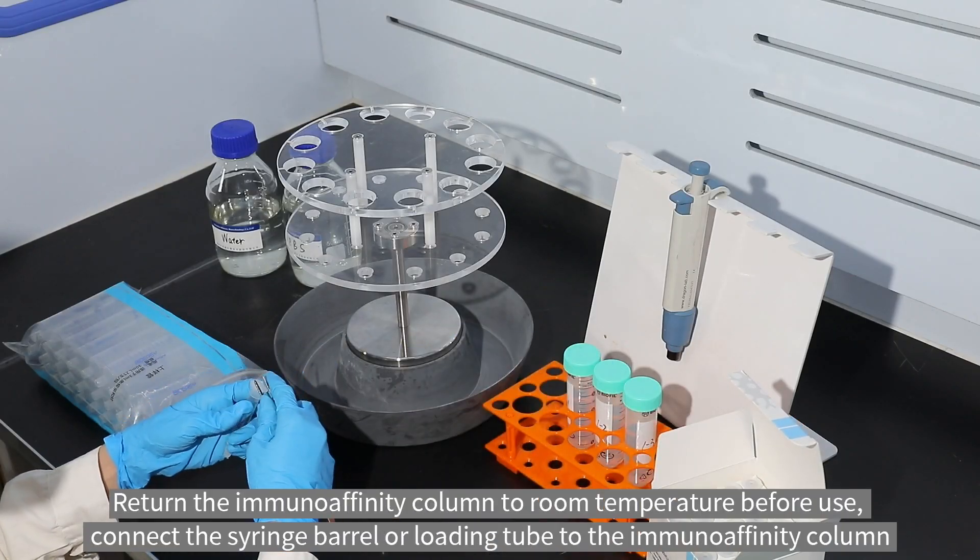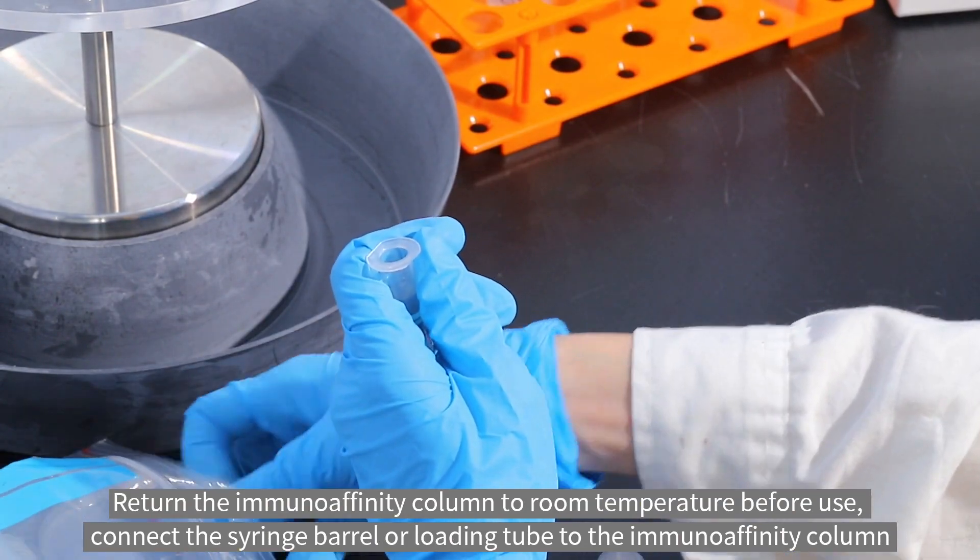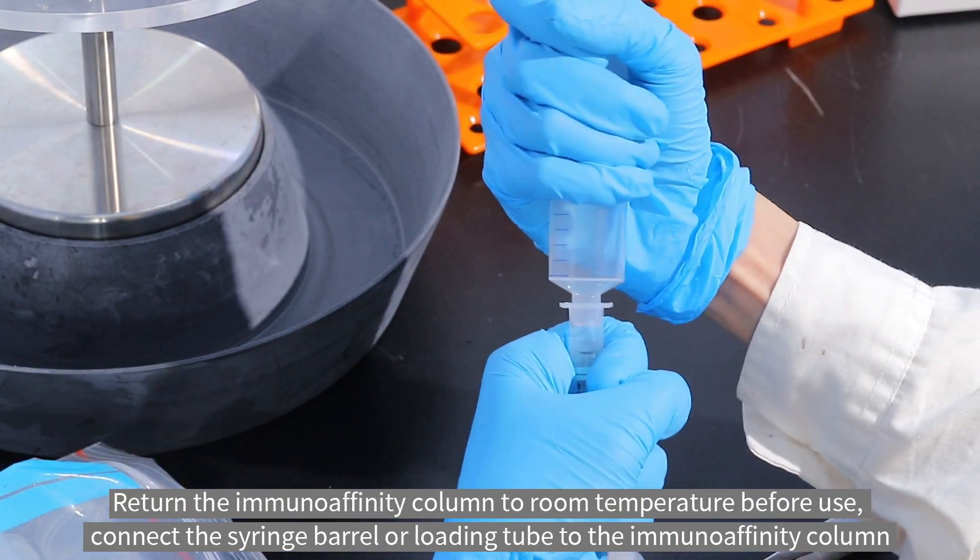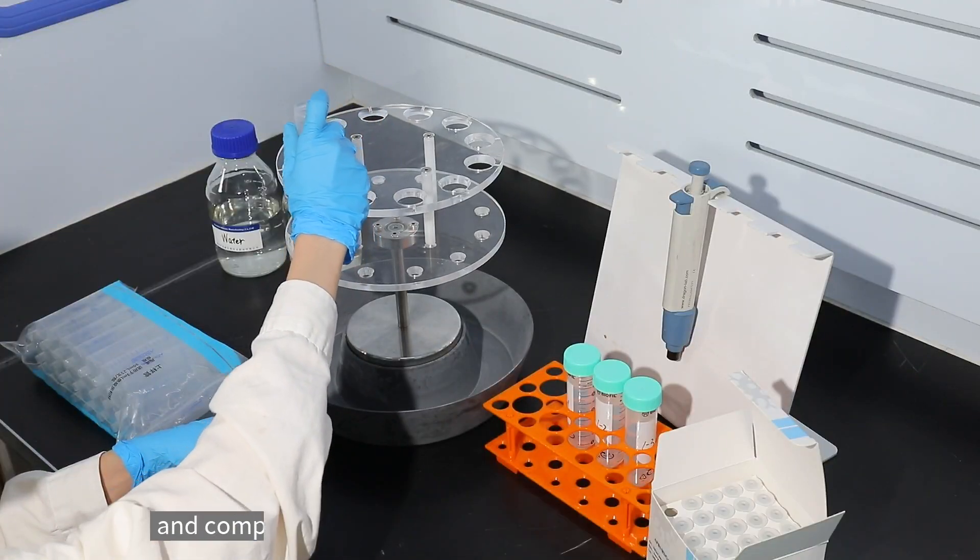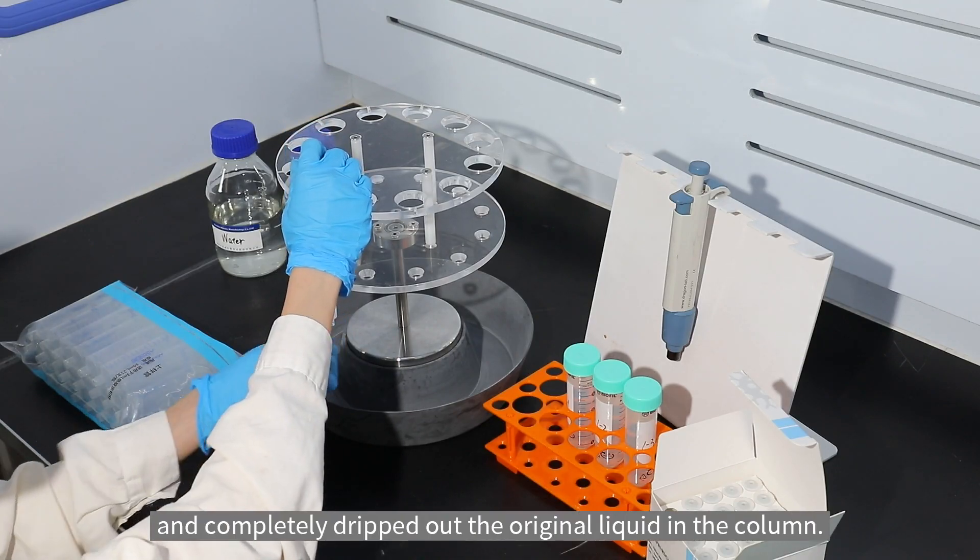Return the immunoaffinity column to room temperature before use. Connect the syringe barrel or loading tube to the immunoaffinity column and completely drip out the original liquid in the column.